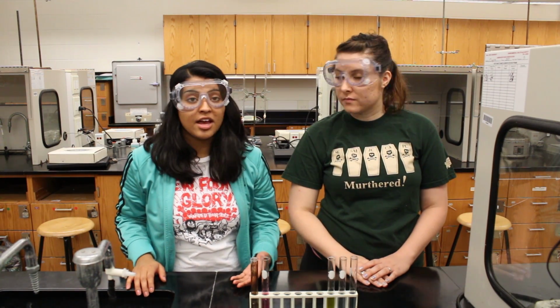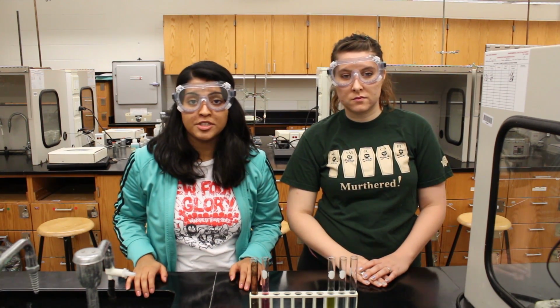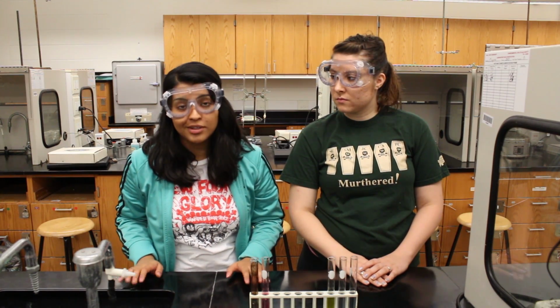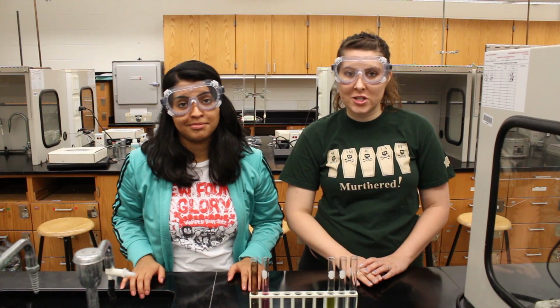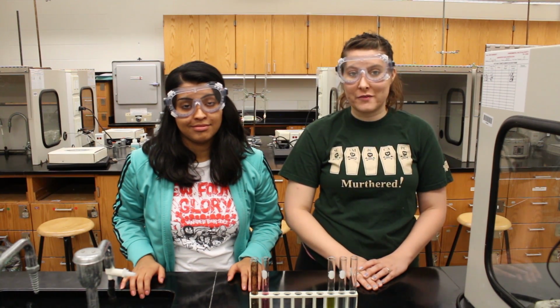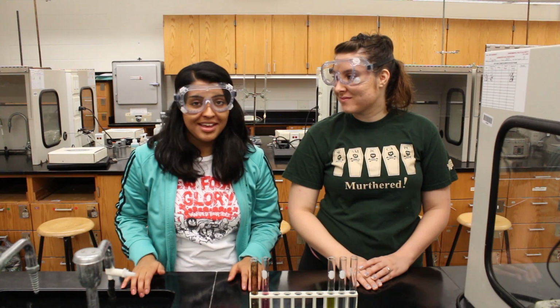In the last part of the lab, you will test the oxidative properties of both aldehydes and ketones using the potassium chromate. And remember, as always, have fun. And be sure to dispose of all waste in the appropriate waste containers and to wash your hands before leaving lab today. Yeah, I guess that's important.